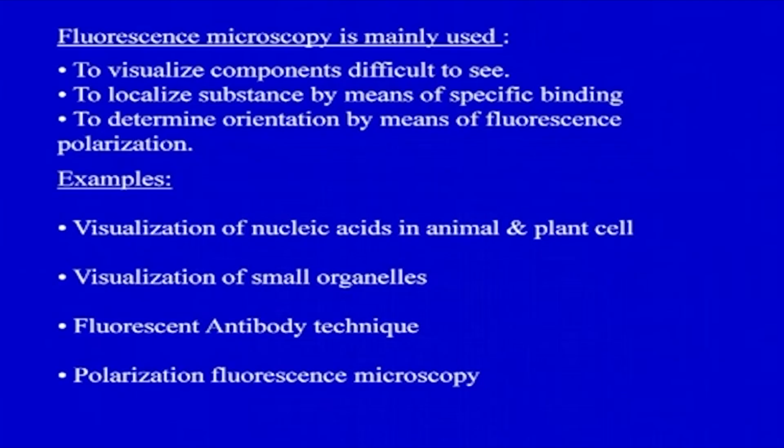Another application is through the fluorescent antibody technique. Like I told you earlier, fluorescent dyes covalently coupled to antibodies can be used to localize specific substances in a sample.